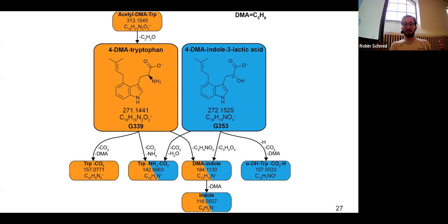And so if we combine everything, we said that we need MS2 spectra for annotation. Of course, the first thing that we would do is annotate manually. I really recommend that to people sometimes, because it's nice to get an idea about fragmentation that can happen in mass spectrometry. And tools can also guide you there. For example, in silico tools can show you what is a probable fragment ion that was produced, or what part of the structure might correspond to signals.